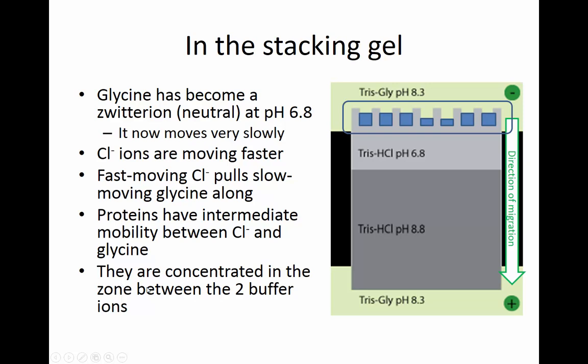They are concentrated in the zone between these two buffer ions, or to be clear, the chloride ion and the glycine Zwitter ion. So that's going to allow them to run very slowly through the stacking gel.